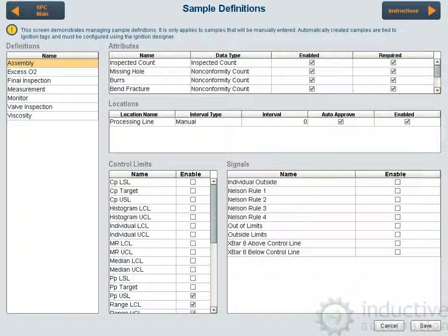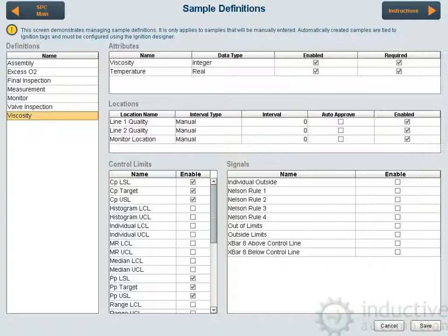In this session I'm going to go over building the definition management screen. This is how you define what sample data to accept whenever manually entered samples are entered. For example, if I go to viscosity here it will ask for or require the viscosity value, which will be an integer value, and the temperature value. These are the locations that it's appropriate to take that viscosity sample. Whenever data is automatically collected, the control limits are evaluated and the signals or rules are evaluated.